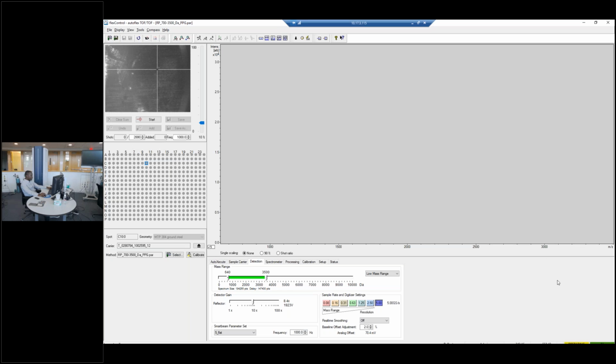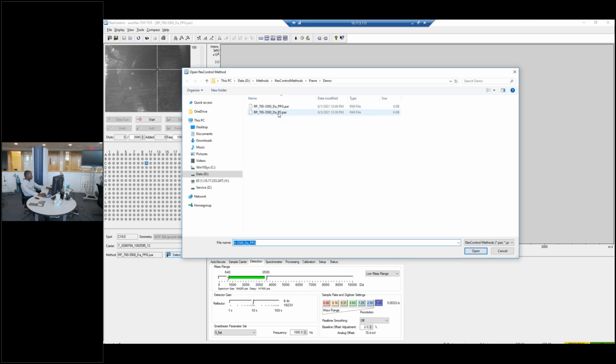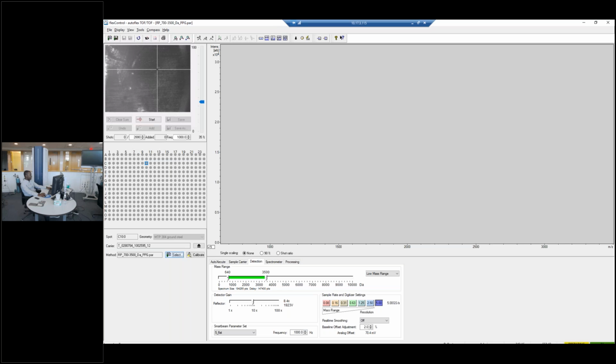And then another window down here is for the different settings of the instrument for different samples. If you're analyzing a low molecular weight sample versus a high molecular weight sample, you'll need slightly different settings. But this is not something that you have to worry about because it all comes loaded into the different methods that carry all that information basically.